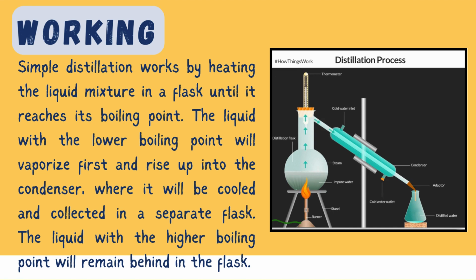The liquid state of the material obtained after the condensation is collected in another vessel, which is the separated ethanol from water, and the rest of the water is left over in the distillation pot. So guys, I hope this simple working of simple distillation is clear to you.